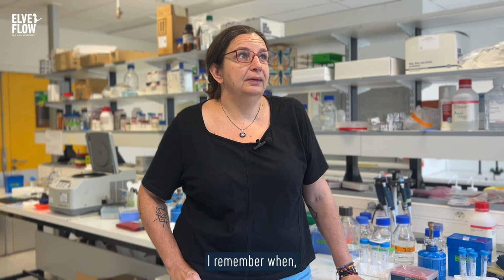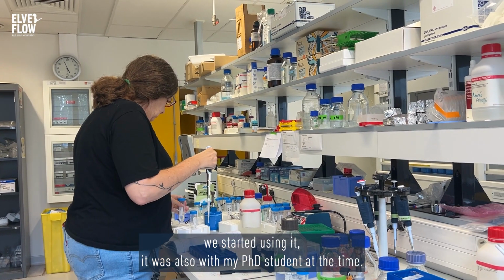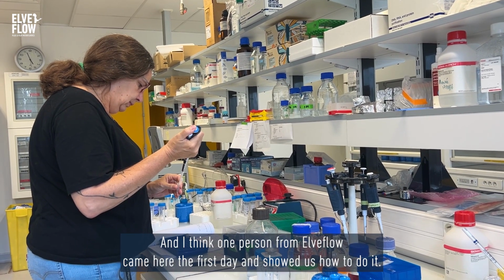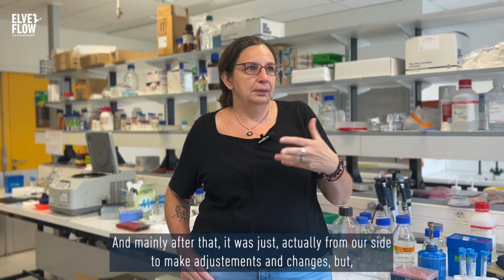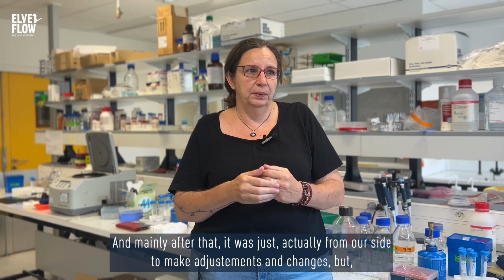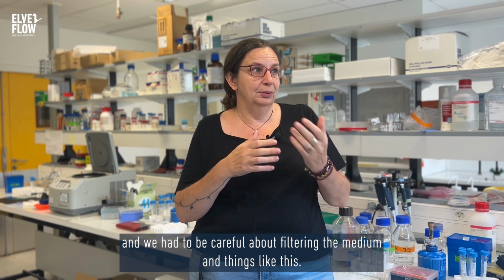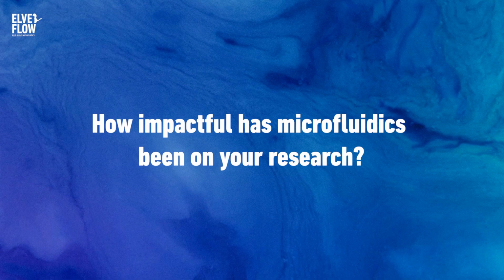I remember when we started using it, I was with my PhD student at the time, and I think one person from Elveflow came here the first day and showed us how to do it. After that, it was mainly from our side to make adjustments and changes, and we had to be careful about filtering the medium and things like this. More or less, we were still using the same protocol that we used at the beginning.